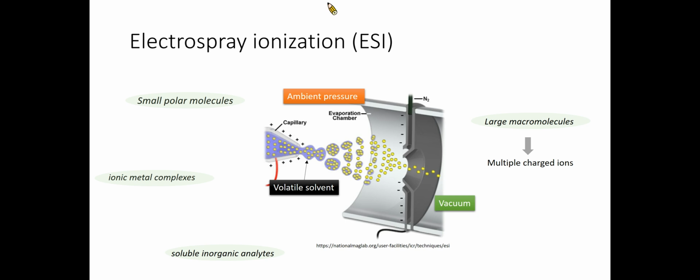Most high mass analytes examined by ESI readily form multiply charged ions. Normally, it is therefore sufficient in ESI mass spectrometry to cover the range up to a mass-to-charge ratio of 3000 for the detection of ions. This does not preclude, however, that ESI can produce ions of much higher mass-to-charge ratio. Even ions at a mass-to-charge ratio of 85,000 have been observed.